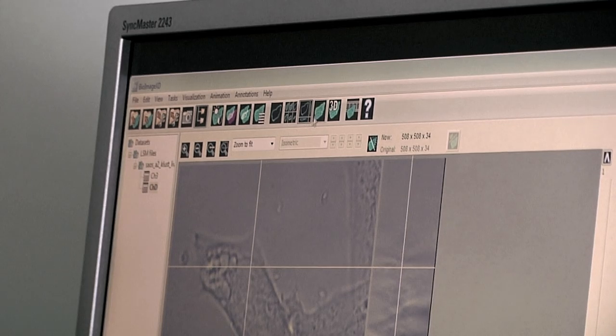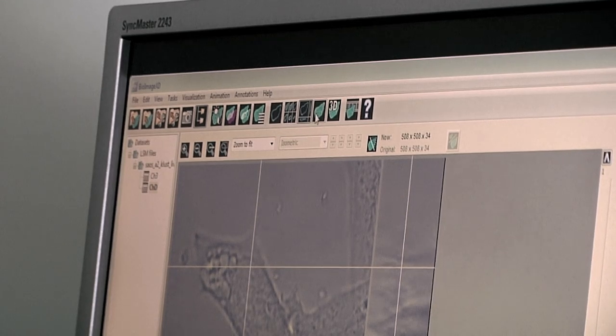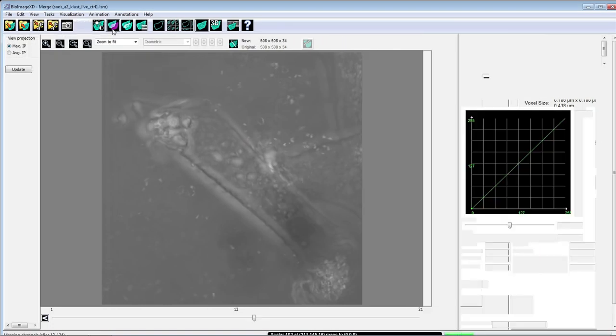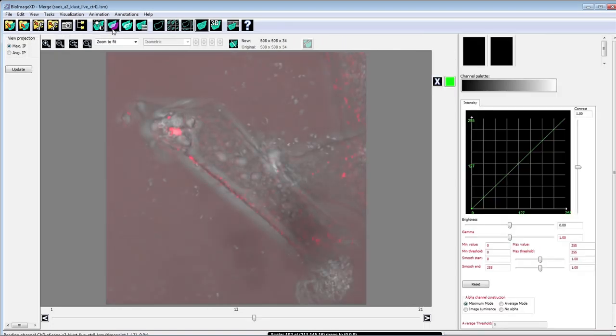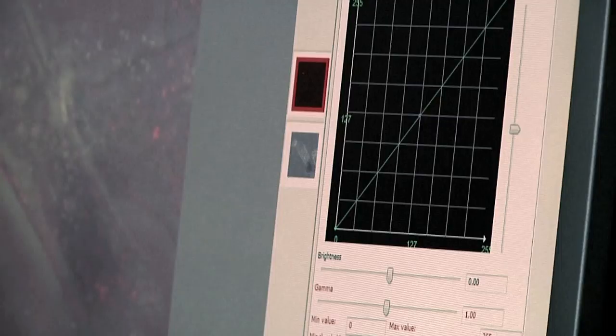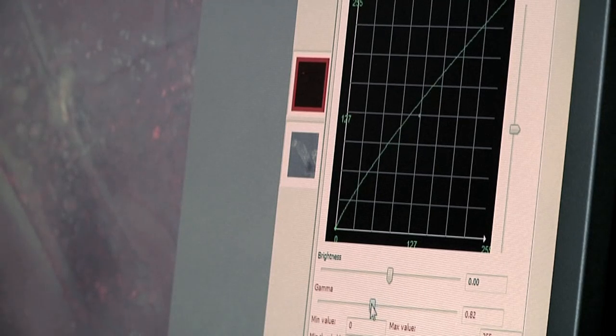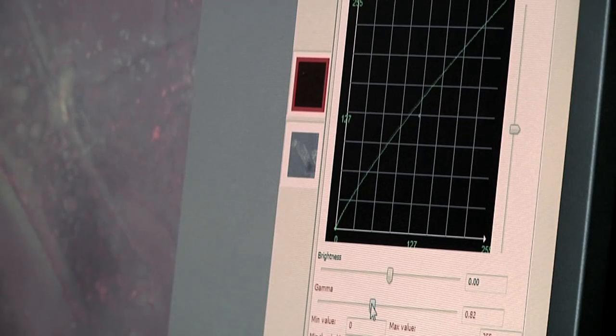The main advantage of BioImage XD is that it has in a single package the basic features that you need for processing your images, like noise reduction and so on. Then it has analysis features for actually getting quantitative analysis results.